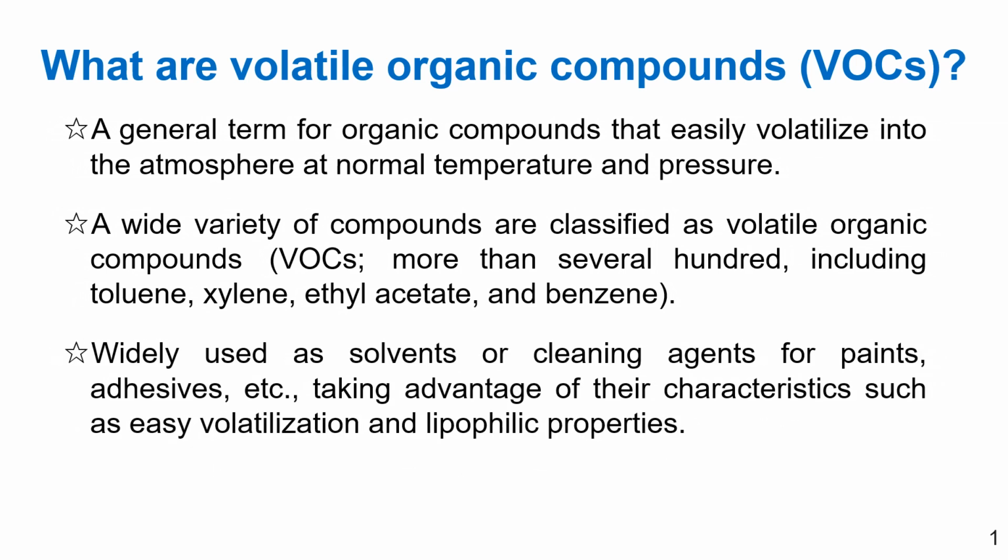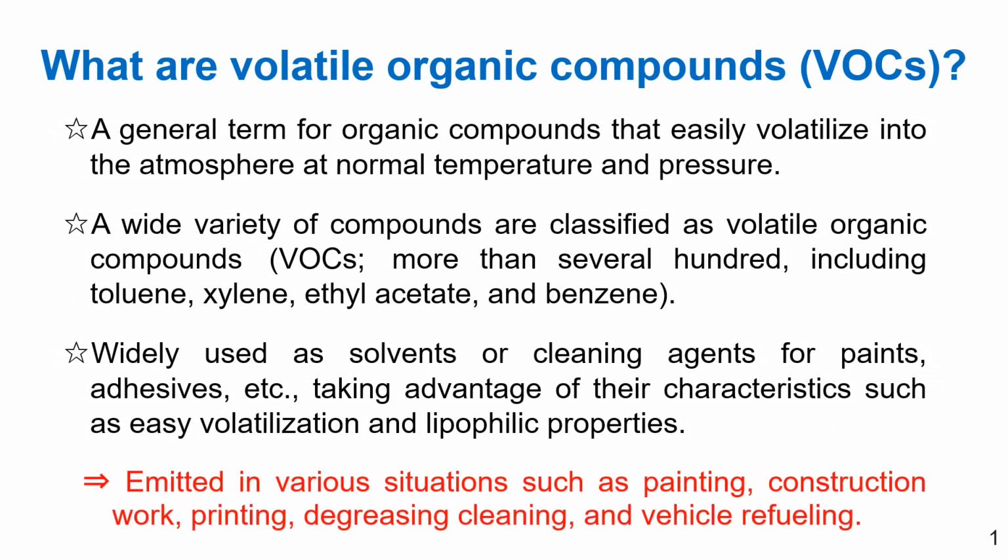And VOCs, which are highly volatile and lipophilic, are widely used as solvents, thinners for paints and adhesives, and as cleaning agents, and so on. So, they are emitted into the atmosphere in a variety of situations such as painting, construction work, printing, degreasing, cleaning, and vehicle refueling.